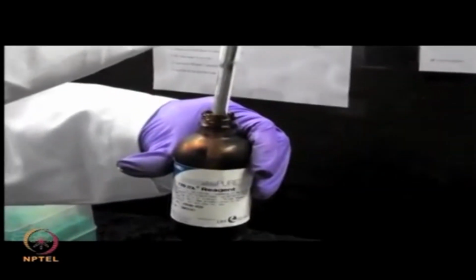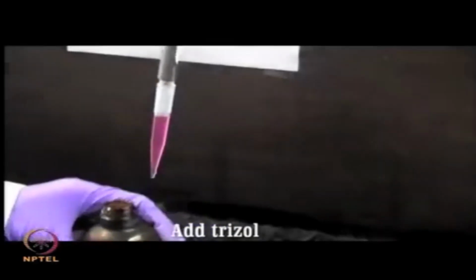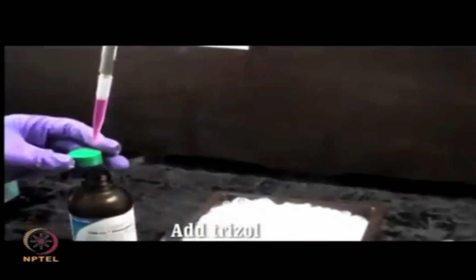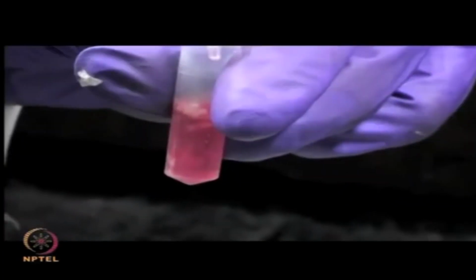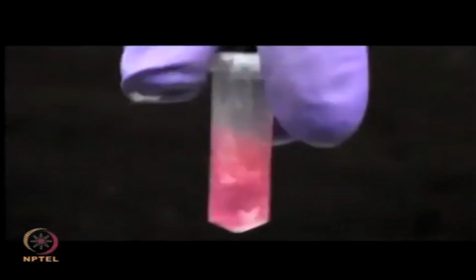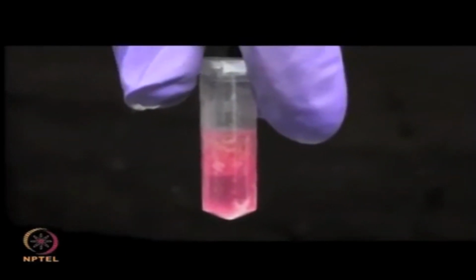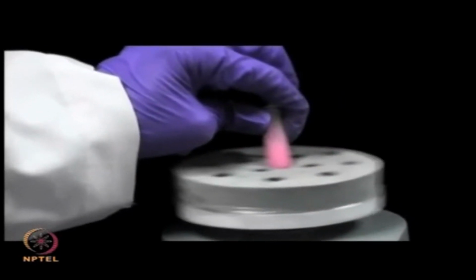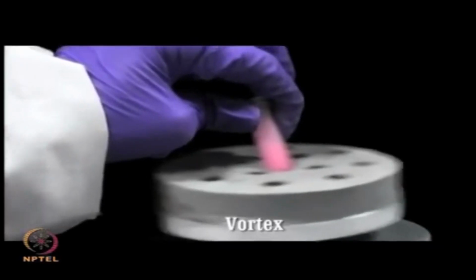Protein extraction. The trizol extraction protocol allows efficient separation of not just the bacterial proteins but also their DNA and RNA. Add the trizol reagent consisting of guanidinium thiocyanate, phenol and chloroform to the supernatant obtained after sonication. Mix the contents thoroughly by vortexing.